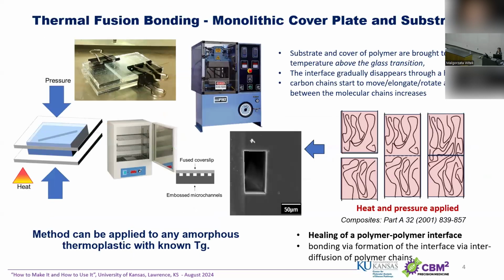A lot of surface modification, for example, some kind of covalent attachment of an agent, we perform when the microfluidic or nanofluidic is actually enclosed. So imagine, for the sake of this conversation, a microfluidic.